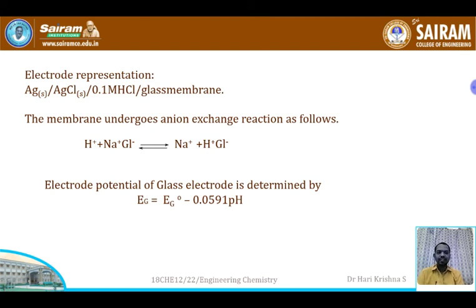You know that glass is nothing but sodium silicate. The H+ will get exchanged with the Na+ of the glass, and that Na+ will come out and be liberated. Once again, the H+ present outside will get attached to the glass. It is a reversible reaction. So this reaction occurs until H+ ions inside the bulb and outside the bulb are equal.